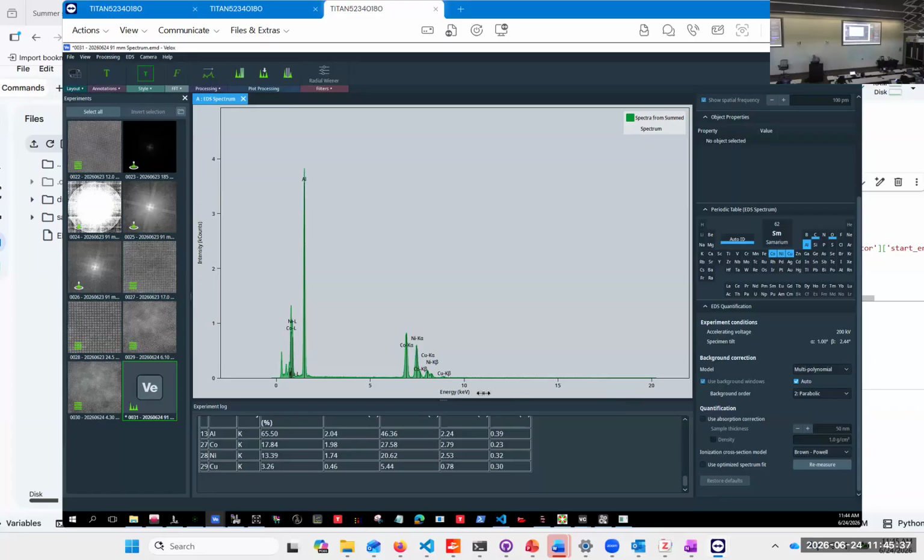Let me see, do I have? Okay, I'm not sure what the problem is. Good.